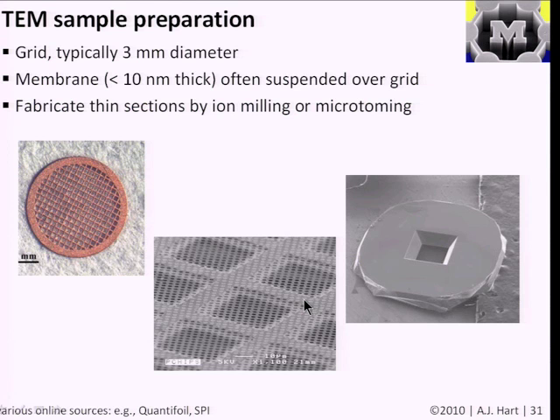So if I can make my individual silicon nanowire or carbon nanotube hang over a gap with nothing in the background, then I'm only going to interact the electron beam with what I want. If, for example, it's too small to be suspended or too fragile, I could put it on a very, very thin film, like a very thin plate. Then I'm going to sacrifice some resolution because of the interaction of the beam with that film or plate, but I'm going to be able to image it.